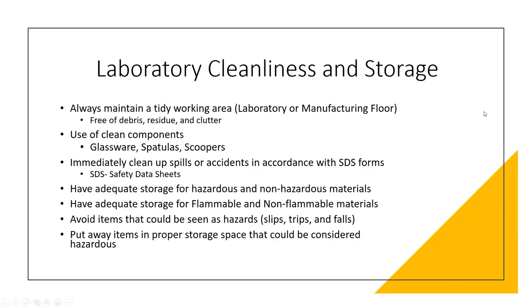All right, we're going to move on to laboratory cleanliness and storage. So, a laboratory can be a potentially dangerous environment if not kept clean and tidy. A cluttered or unorganized laboratory could result in inaccurate results, contamination, or safety hazards. So, again, safety is popping up here, contamination is popping up. And these are all things that we have already covered so far. So, we want to make sure that we are maintaining a tidy work area. We saw in the video, we want to make sure that we're keeping bags or trip hazards or anything out of the aisles of the lab. We want to make sure that everything is free of debris, residue, and clutter.